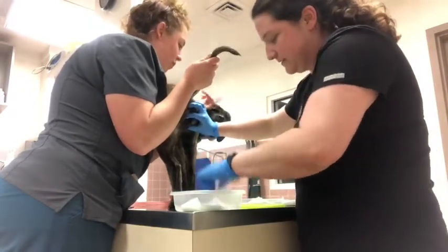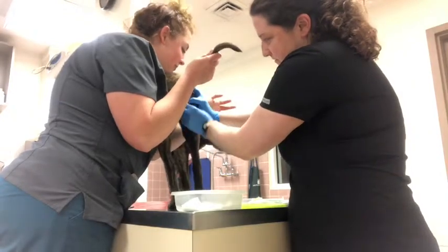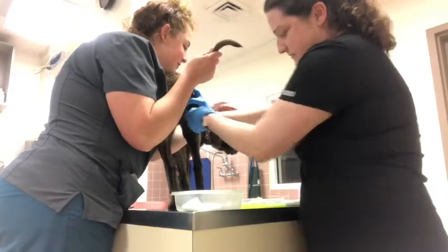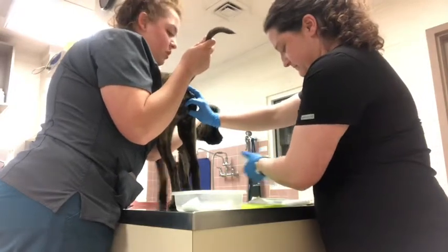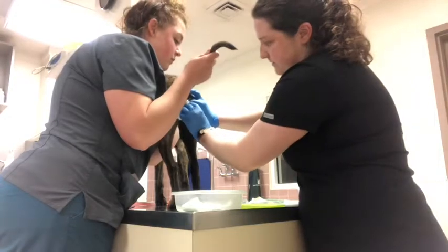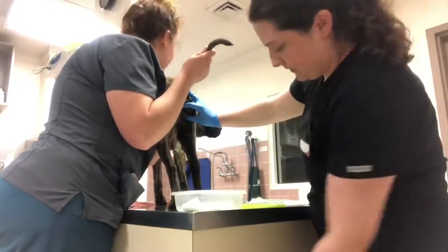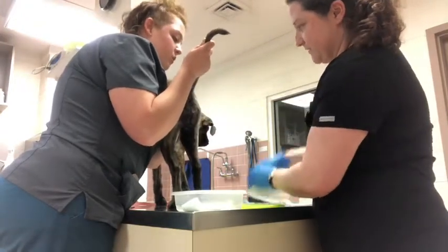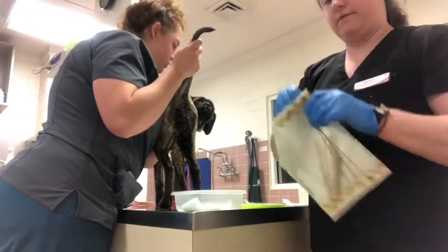I'm going to clean her vulva with some chlorhexidine, and then sterile saline. Chelsea is going to hold her tail so that it stays away from her vulva.